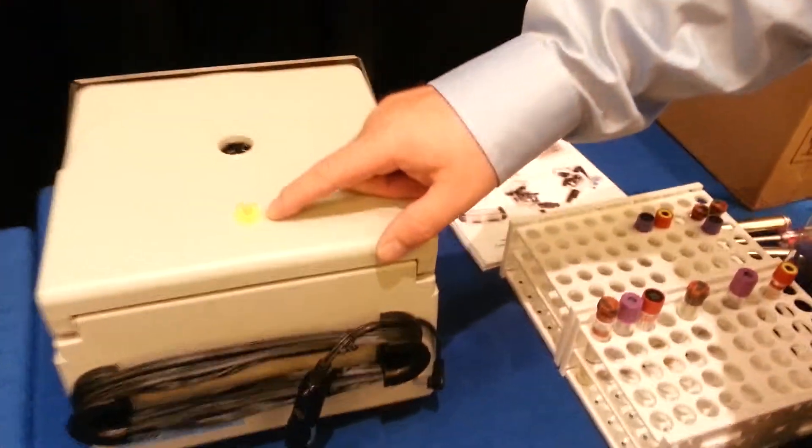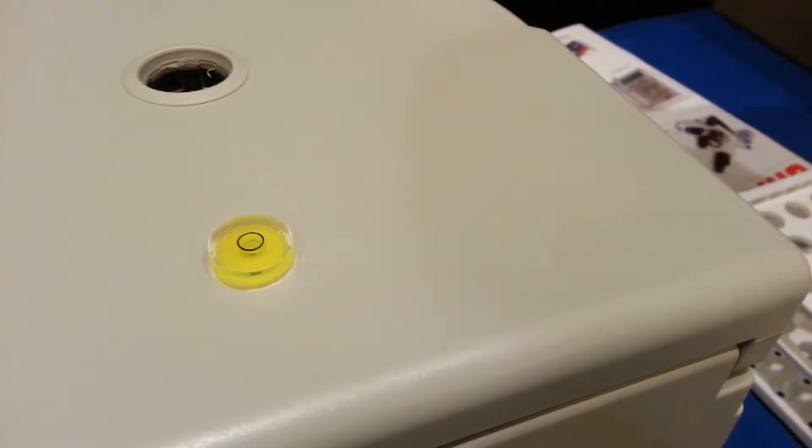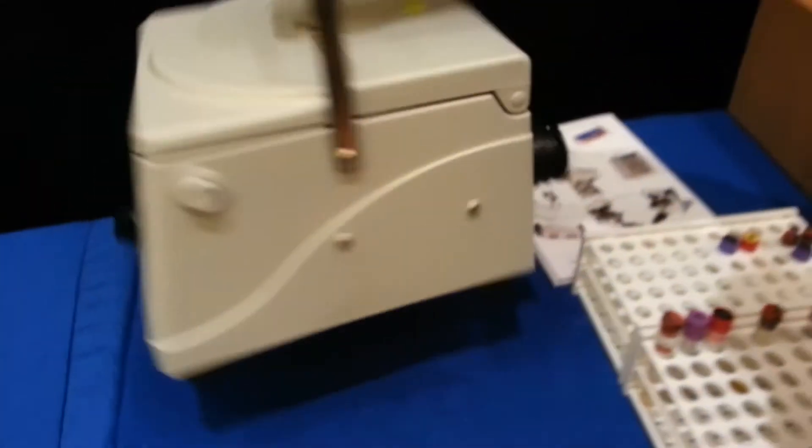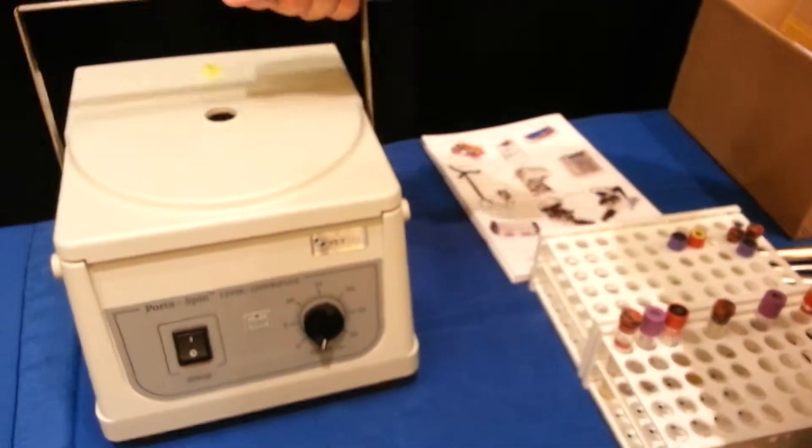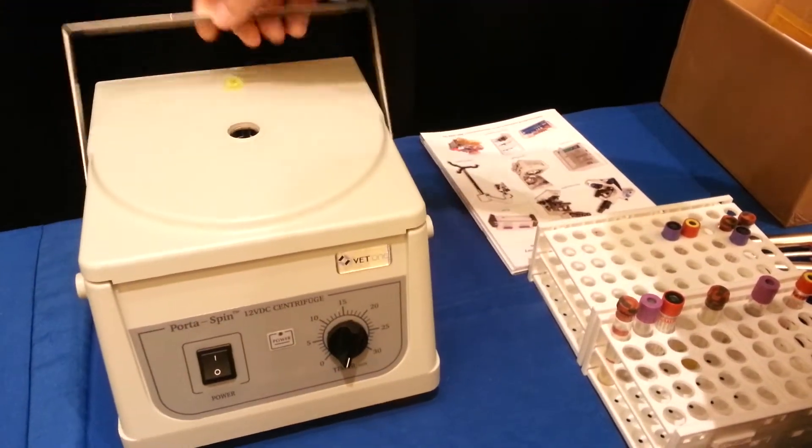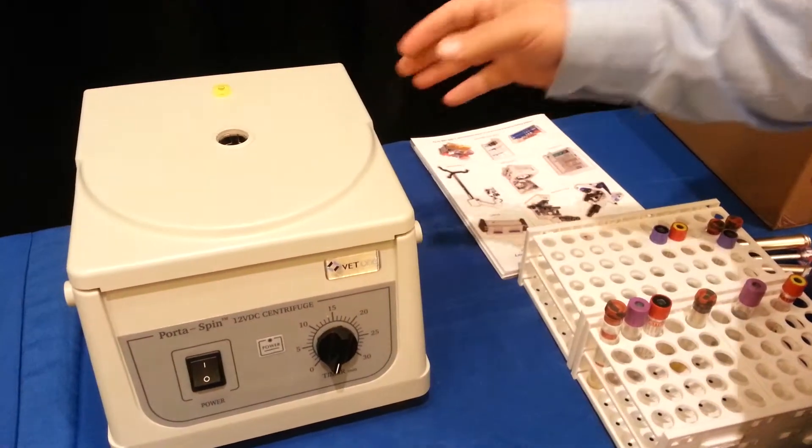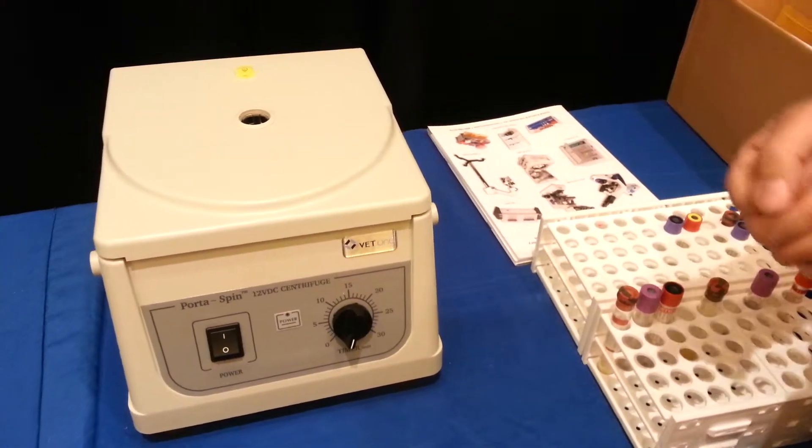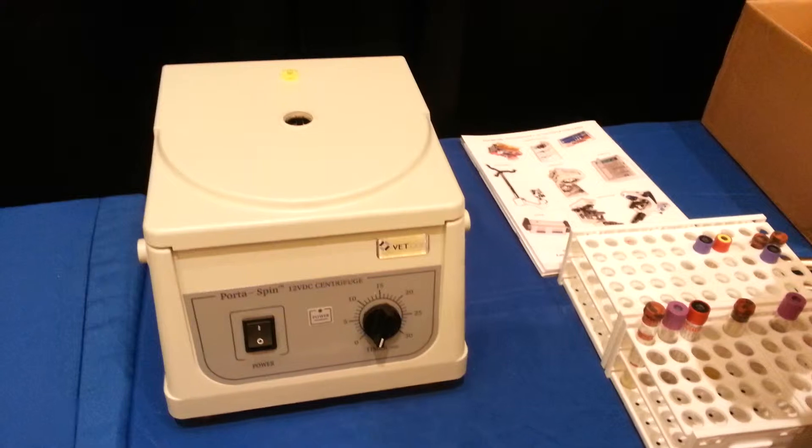On the top here, we've got a fisheye level to make sure you're level before you start spinning, or as close to level as you can get. Very lightweight, as you can tell. Great for mobile vets. They can get their samples spun down before they get back to their practice.